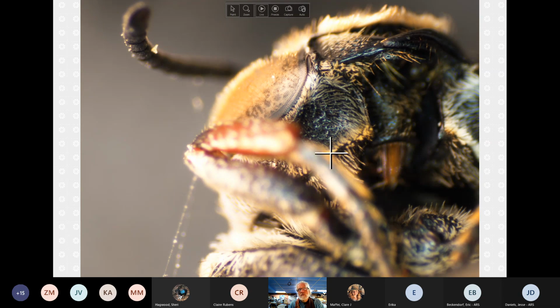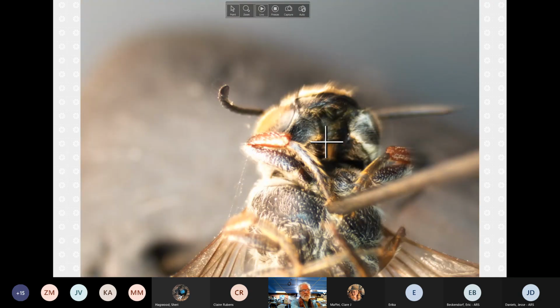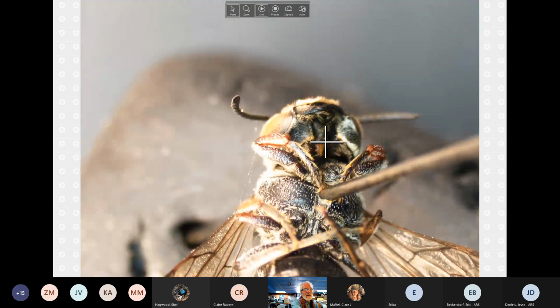So anyway, this angle here is supposed to be less than 90. It's a little bit difficult to tell from this angle because we're not really looking at it in the proper plane. I'm looking at it and thinking, well, it could go either way for me, from slightly oblique to less than. But in theory, we would be wiggling it back and forth to get that angle documented, which we have no time to do.